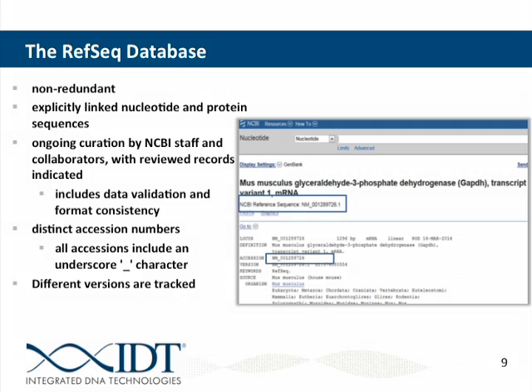So anybody can just download and dump their sequence information into NCBI. So if you do a BLAST search and you come up with a sequence that has an identifier of AF or something that's not one of your standard identifiers, then you might have to worry about the accuracy of that sequence. But if you're looking at an NM, a curated mRNA sequence, it's the best place to go to get your sequence of interest because it has been curated and annotated. Okay.